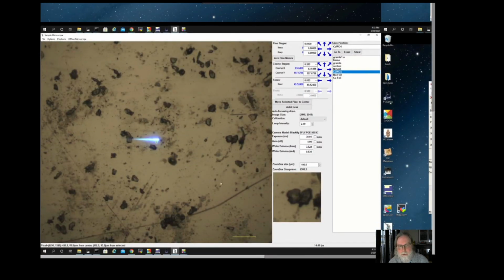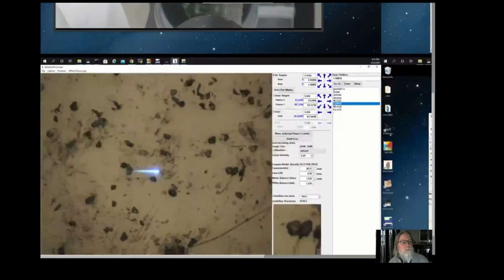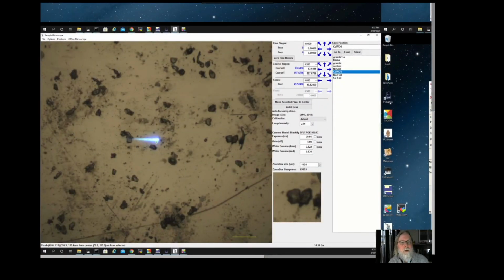So I think that's for now enough for the X-ray microscope and visible light images. We will talk about these more as we collect data. We'll circle back to all of the applications, but that's the microscope and driving your sample around.